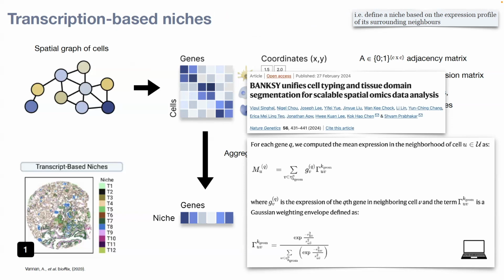Because typically when you start looking at your tissue, you want to first get an initial idea. If you work with single-cell RNA-seq, typically if you start analyzing 20, 30, 40 data sets, you get an intuition what's the right way. And the same for this topic, no benchmarks yet out there. So most of the times, let's stay easy or use something that you understand from your perspective, because that will also help you to interpret these results better. But we still want to show Banksy, and I think it's a cool tool. And also later you will see Marco with CellCharter. They're really cool tools, and you can try both and assess on your own what's the preferred niche that comes out.